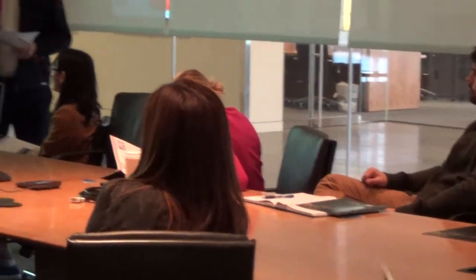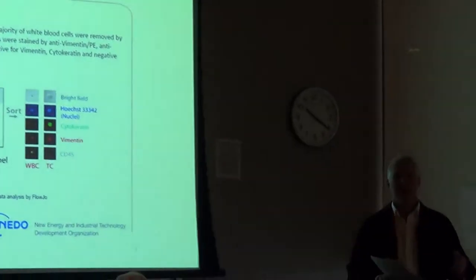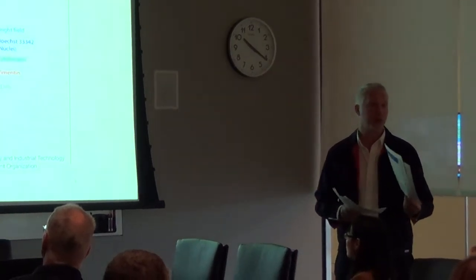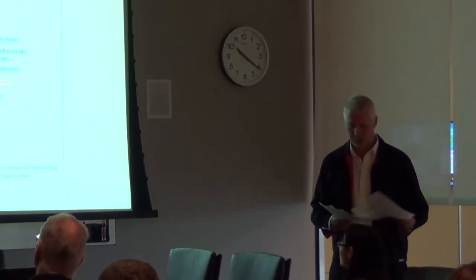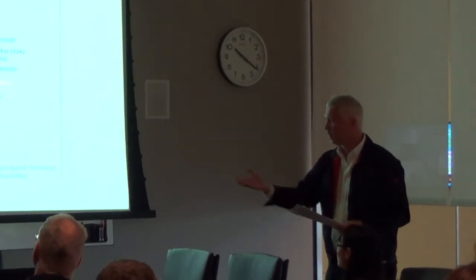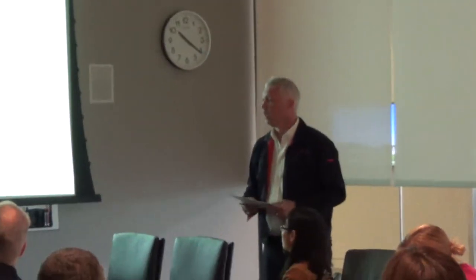The other thing we're working on is trying to culture those. We're trying to show being able to sort maybe even 1, 2, 3, 5 circulating tumor cells and then culture those. I've got a couple of papers to support that in the poster, and you can check that out. I also have the rest of the application deck that I could give to anyone who's interested.